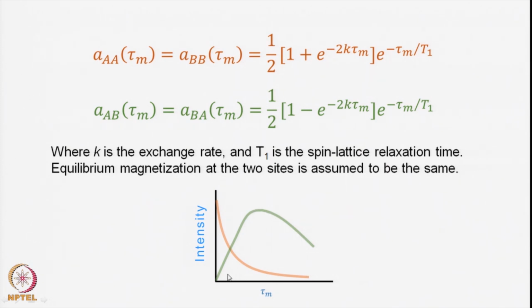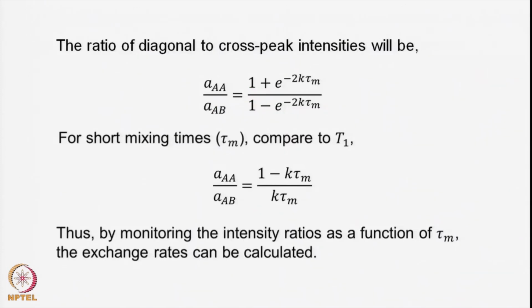This is in the case of cross relaxation, and it is dependent on the interproton distances and how many protons are close by in space, that determines how this diffusion transfer is happening. What is the efficacy of this transfer from one spin to another spin. But of course in the initial times when the mixing time is short, it is linearly dependent on the mixing time, and the transfer will be restricted to one spin only, whichever one is the closest, it will go there only, and that will have a specific application.